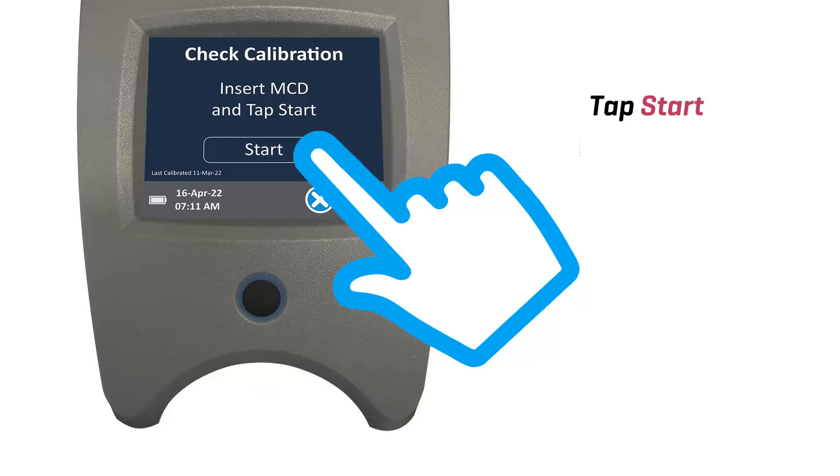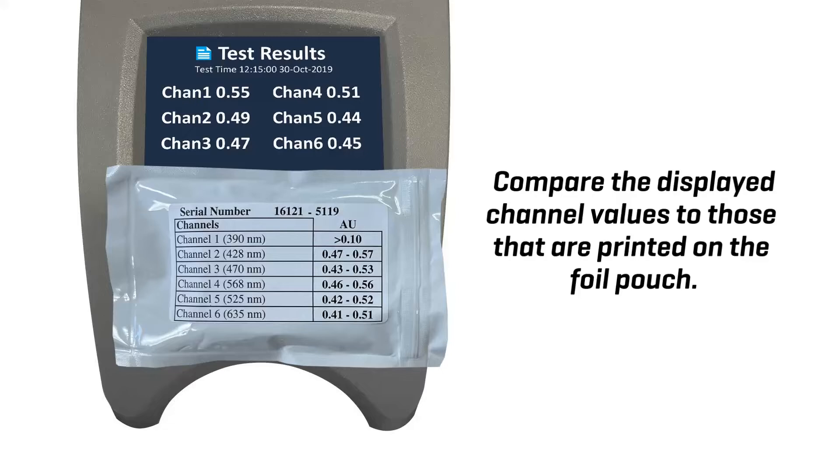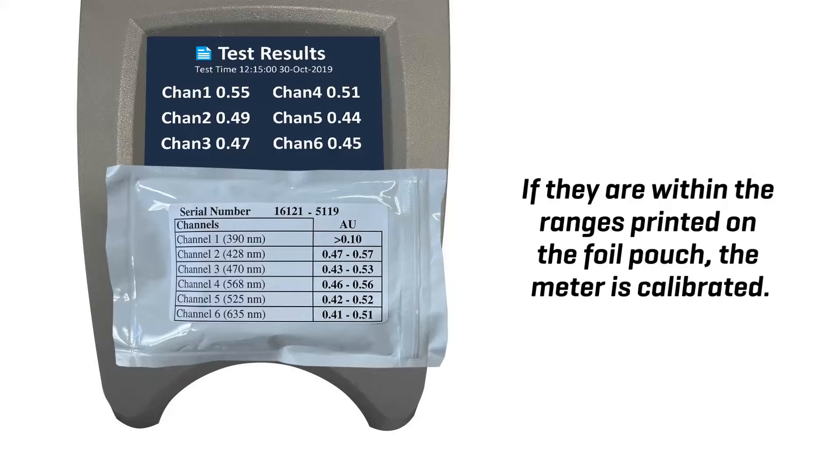Tap start. Compare the displayed channel values to those that are printed on the foil pouch. If they are within the range printed on the foil pouch, the meter is calibrated.